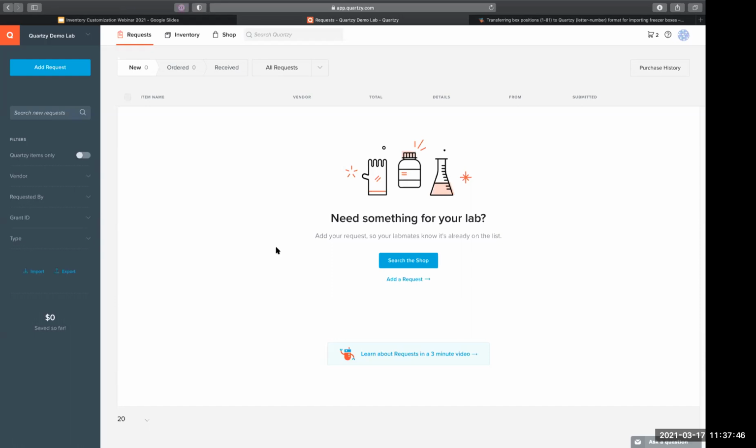So for example, in this case of these pipette tips, I just set it up at, like, let's say five a month, and then just add it to the new request. So I'm talking about two options that should be added. One, automatic decrease, and two, automatic addition to new requests. So that's one thing that I think in the meanwhile can address some of the issue.